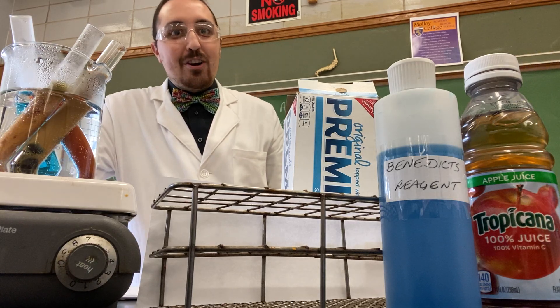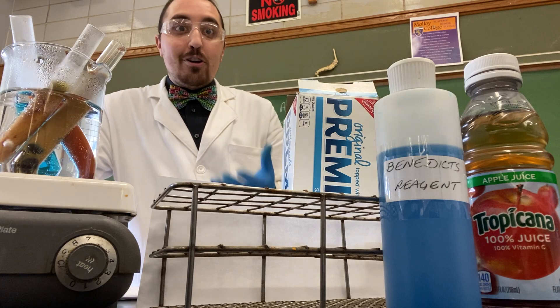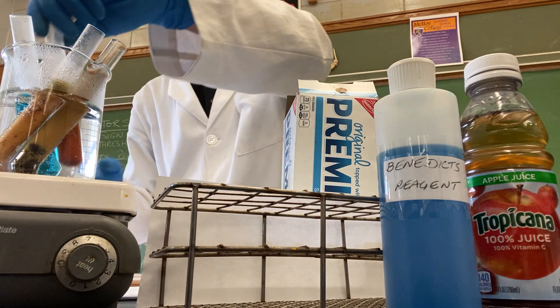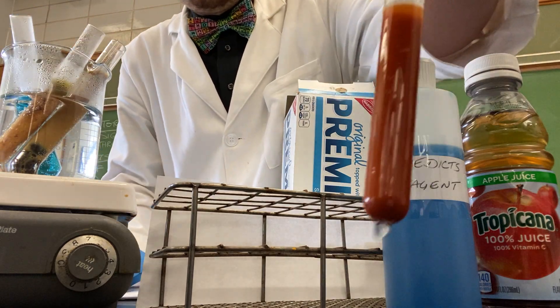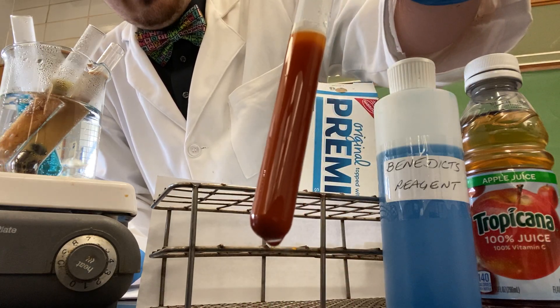Welcome back. We are checking out our different foods to check for sugar levels. We put in some apple juice a little earlier, and you will notice that the apple juice has turned a very dark orange, almost red color.